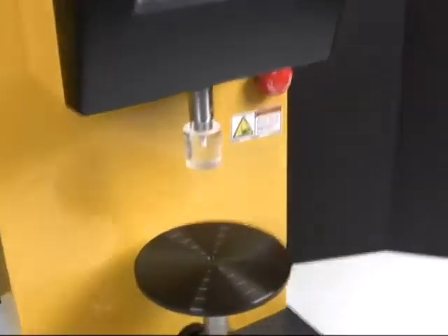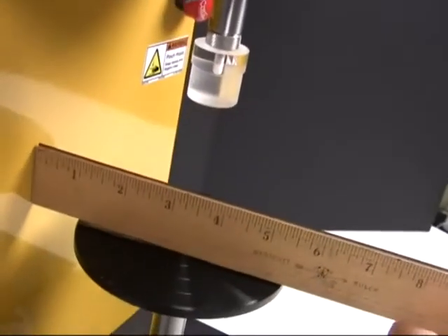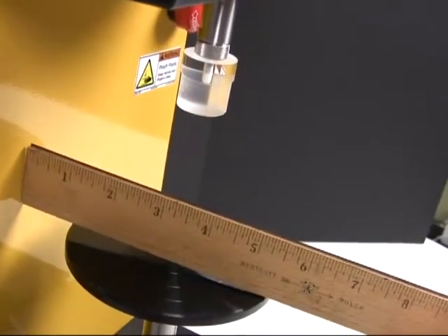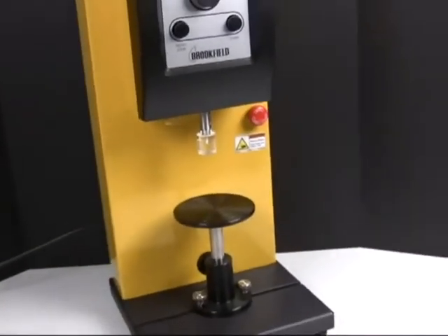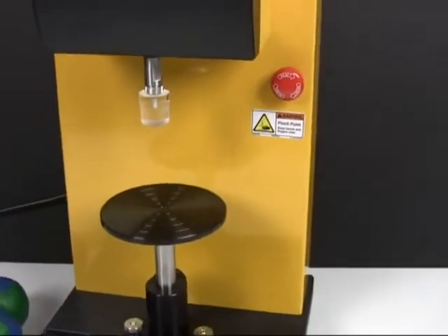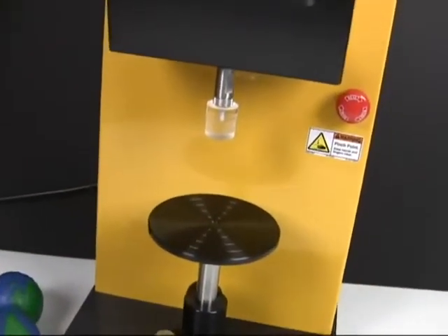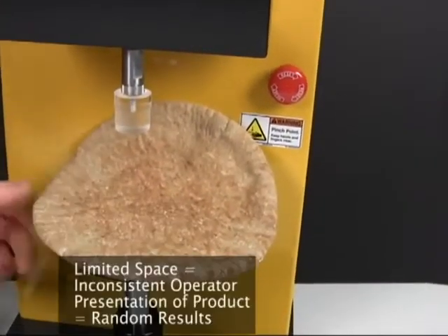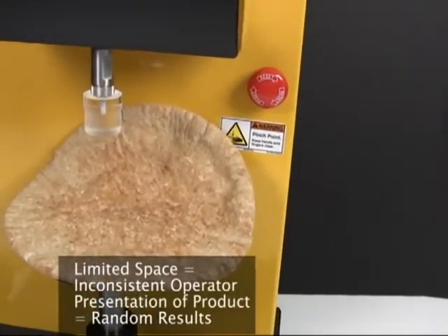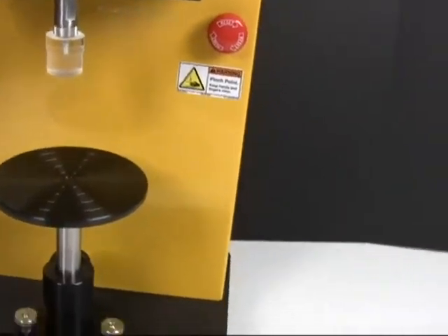The probe is only 3 inches from the back wall as well. You can't test products that don't fit. So any wide object, such as a pita pocket or a tortilla, you actually end up having to either cut them up before you test, or fold them up against the back wall so you can still get the center. From an operator's perspective, that's a pain.